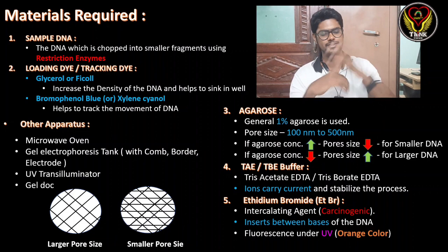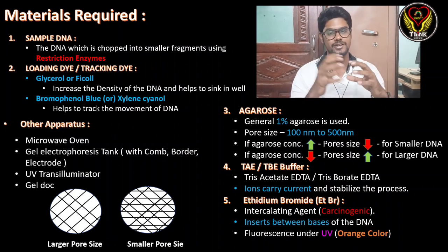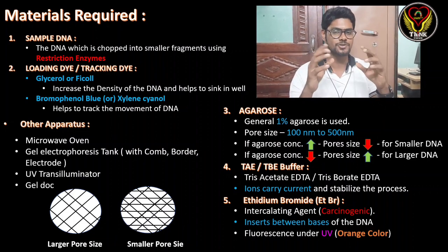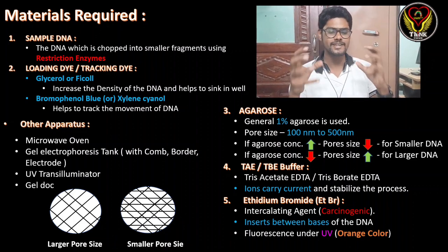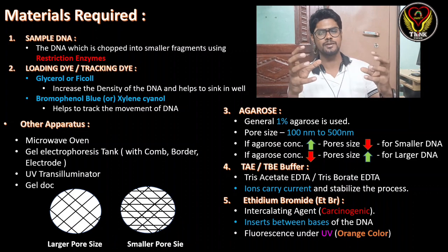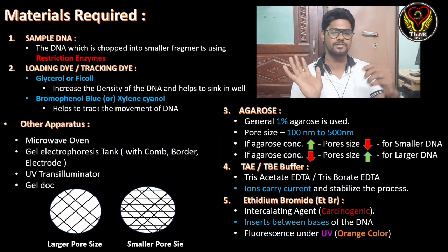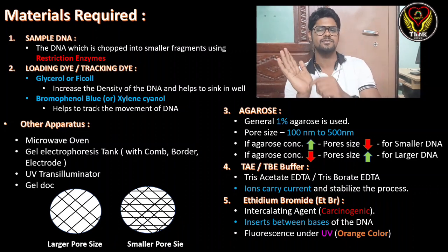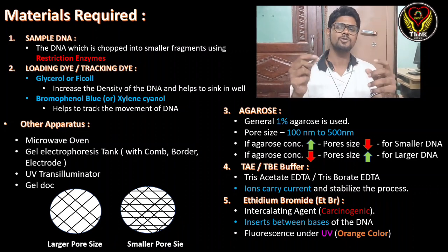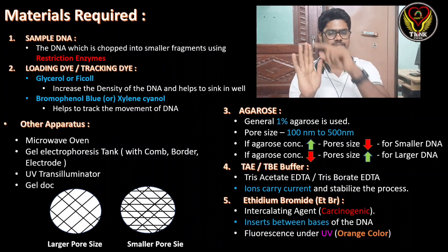And the last important thing is ethidium bromide, EtBr. It is a very carcinogenic agent, so we have to handle it with caution. And it is an intercalating agent. So what happens is it helps to visualize our DNA bands in the UV transilluminator. Our DNA bands will be orange in color. It will help to locate our DNA where it has been separated.